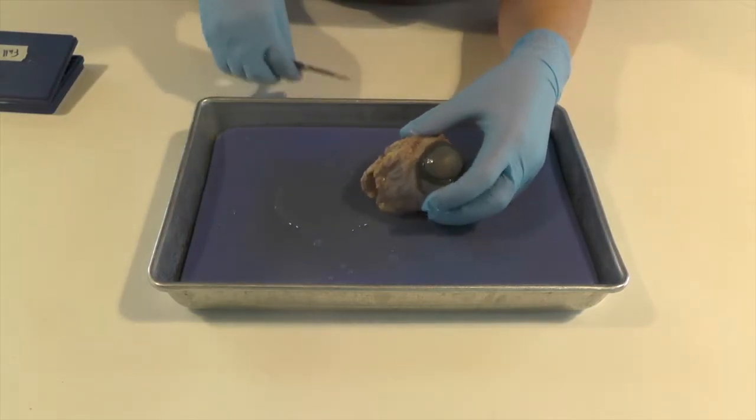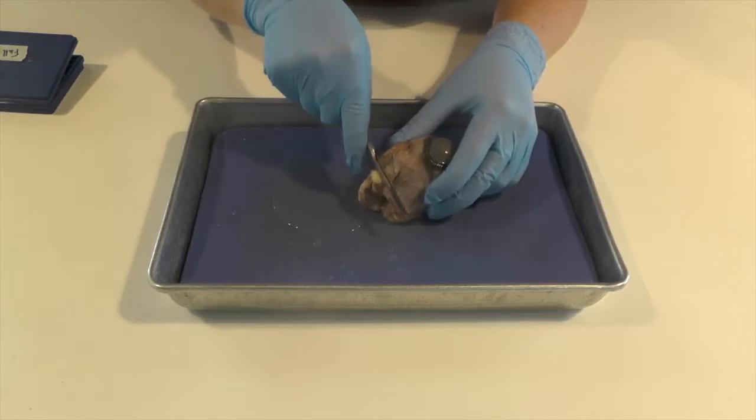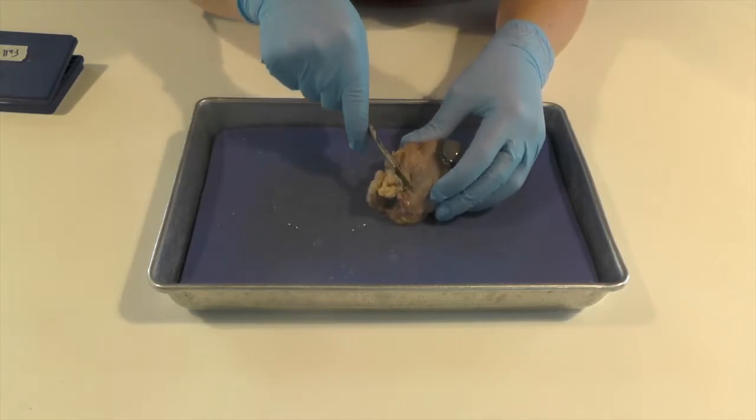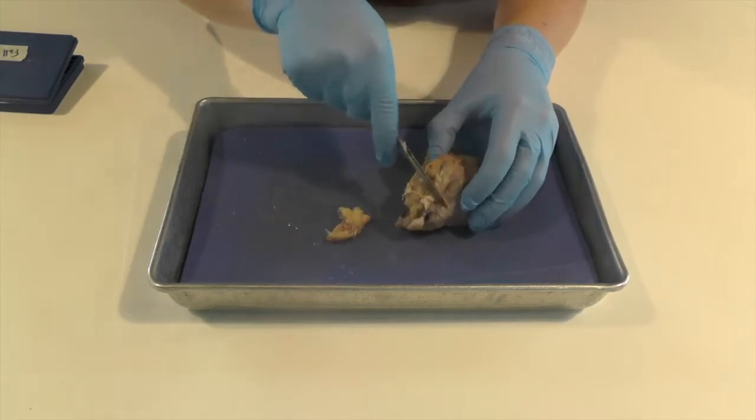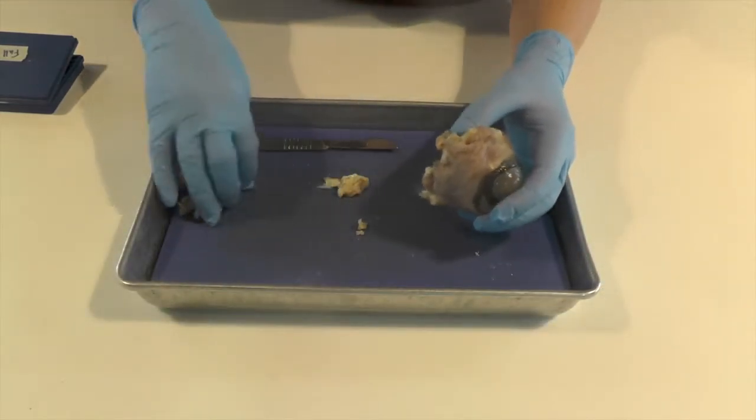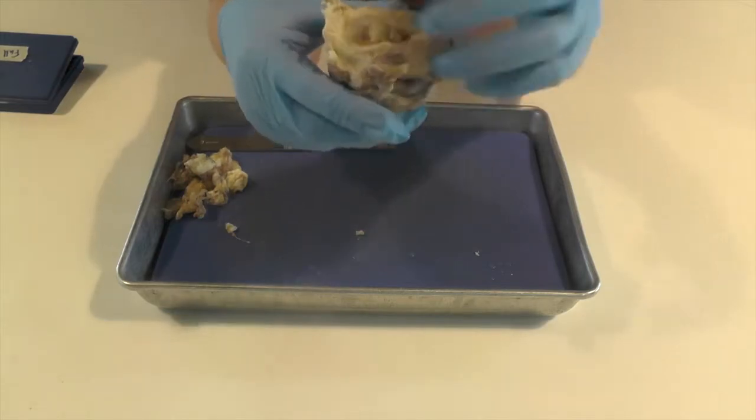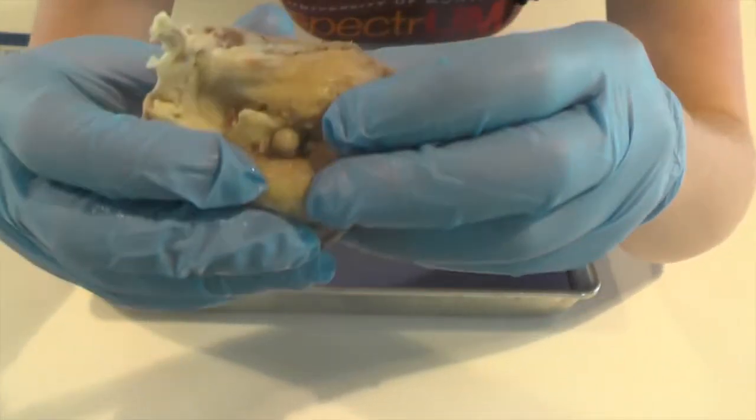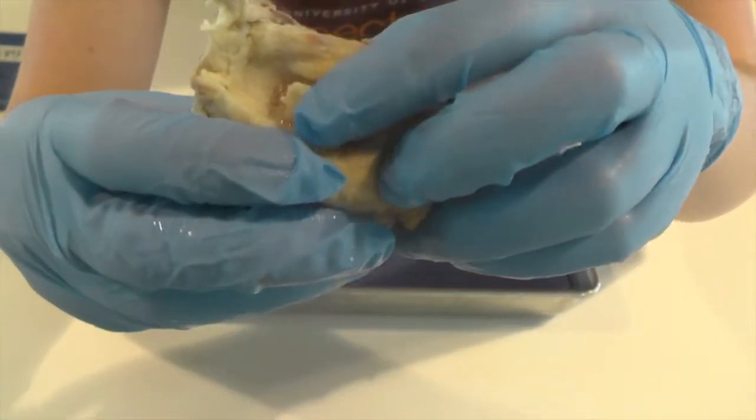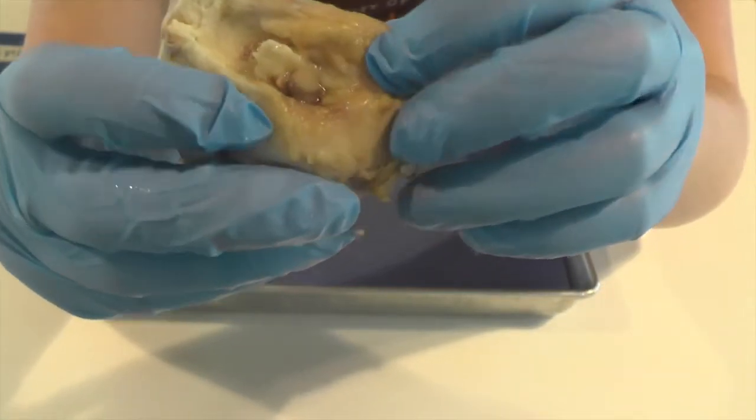So before we see inside our eye, I'm just going to cut out this extra muscle here and fat. Okay so we've got a little extra muscle and fat out of the way here. So you can see the back of the eyeball now. And right back here there's this little nub that you'll notice and that's our optic nerve.